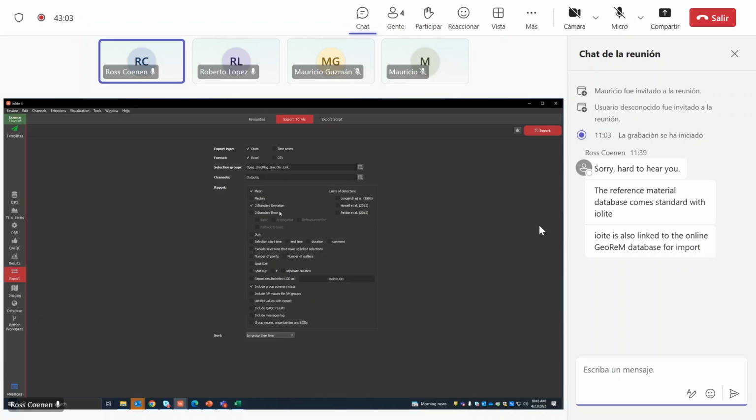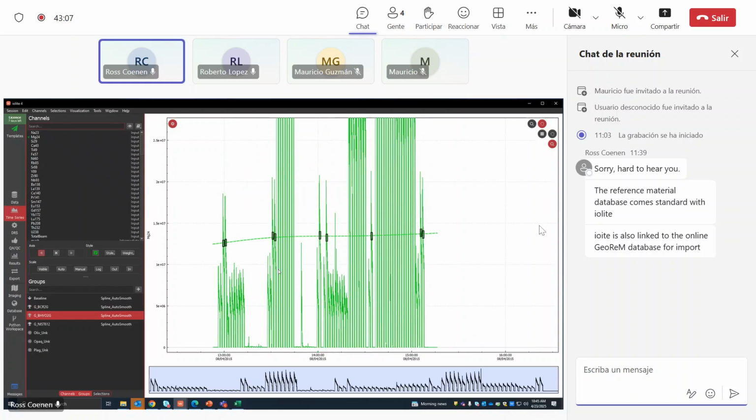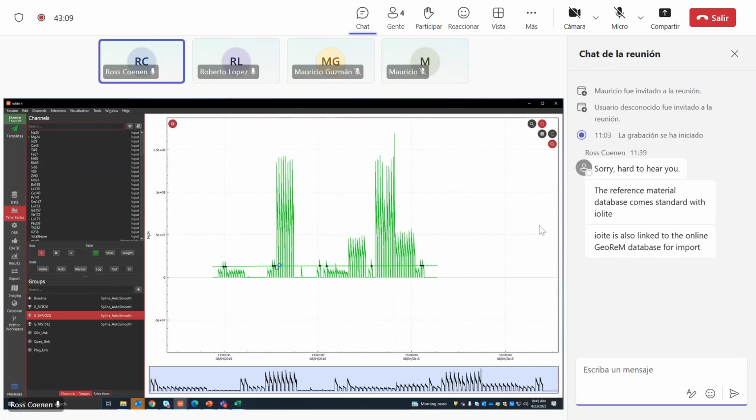Okay. Well, this pretty much concludes how to do data reduction, and I can send a link for an online tutorial that's quite a bit longer, but goes into greater detail, doing the same things I did today, but with more explanation and example data for the customer. If you'd like me to email that. Okay, great. Roberto can email you requesting this link.